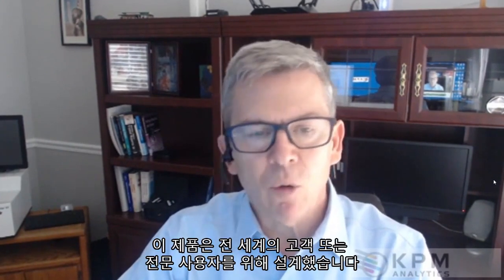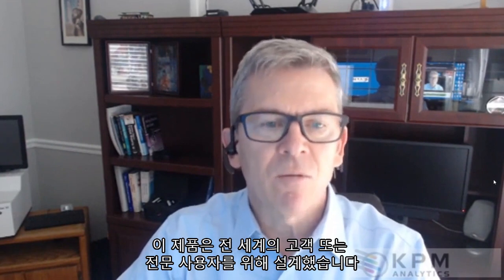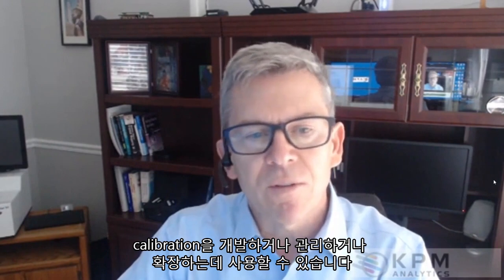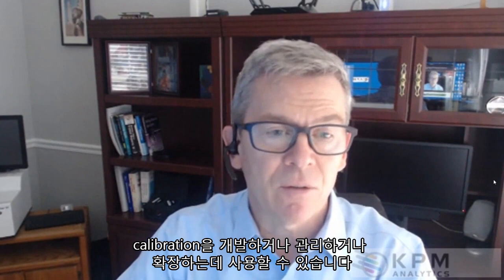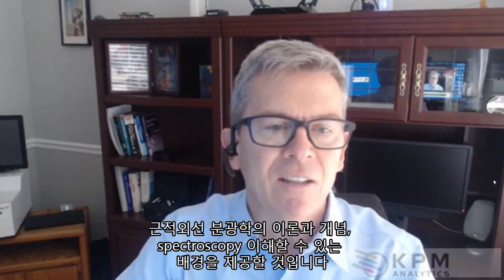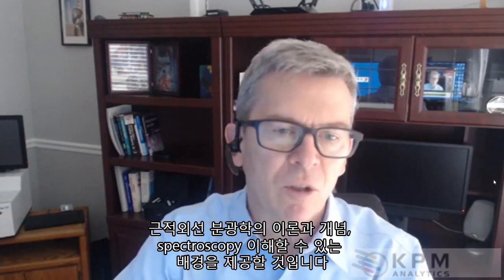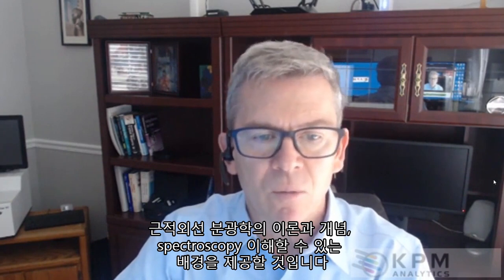So we've designed this course for our users, for our customers, for our specialists around the world that will be using UCal4 to develop or manage or expand calibrations. We've designed this course into various lessons, and the lessons will give you the background to understand the theory and the concept of what we're doing in near-infrared spectroscopy, especially with Unity near-infrared instruments and UCal4 software.